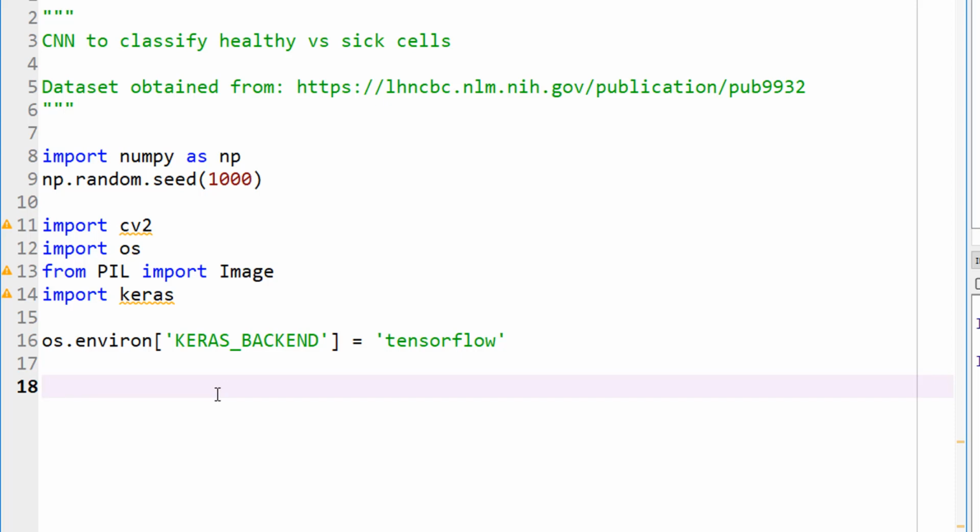So what do we do next? Next, we can start looking at importing our images, resizing, and all of that. But before doing any of that, let's think about what we are trying to achieve. We're trying to segment a whole bunch of uninfected and infected cells, and train an algorithm so that in future, we can look at new images and the algorithm can say, with certain confidence, that this is an infected or uninfected cell. So how do we design our network? The file handling and everything, we'll get to in a minute, but I don't want to spend the bulk of time on it. Let's look at how we design our network.